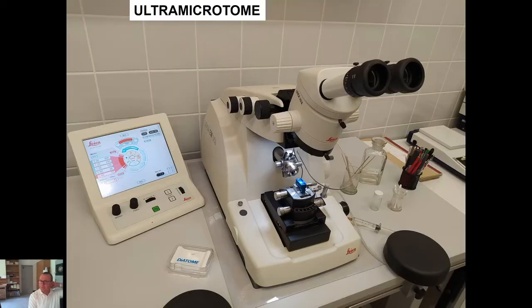If we want to prepare our sections from resin blocks, we must use a more sophisticated machine which is called ultramicrotome.